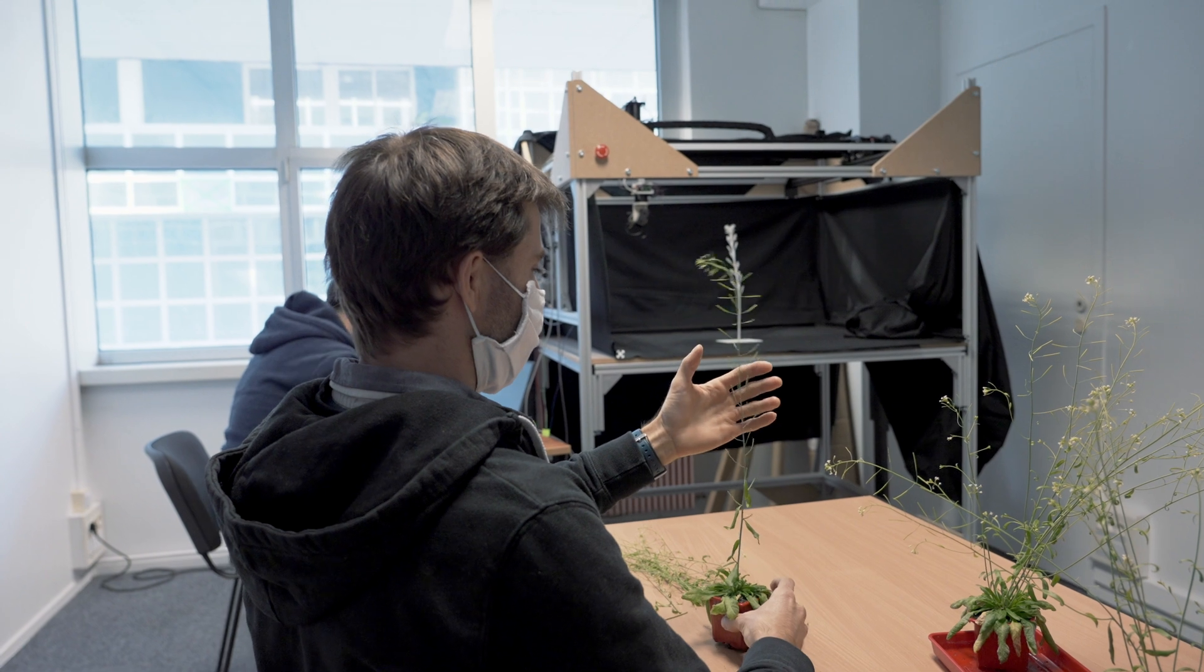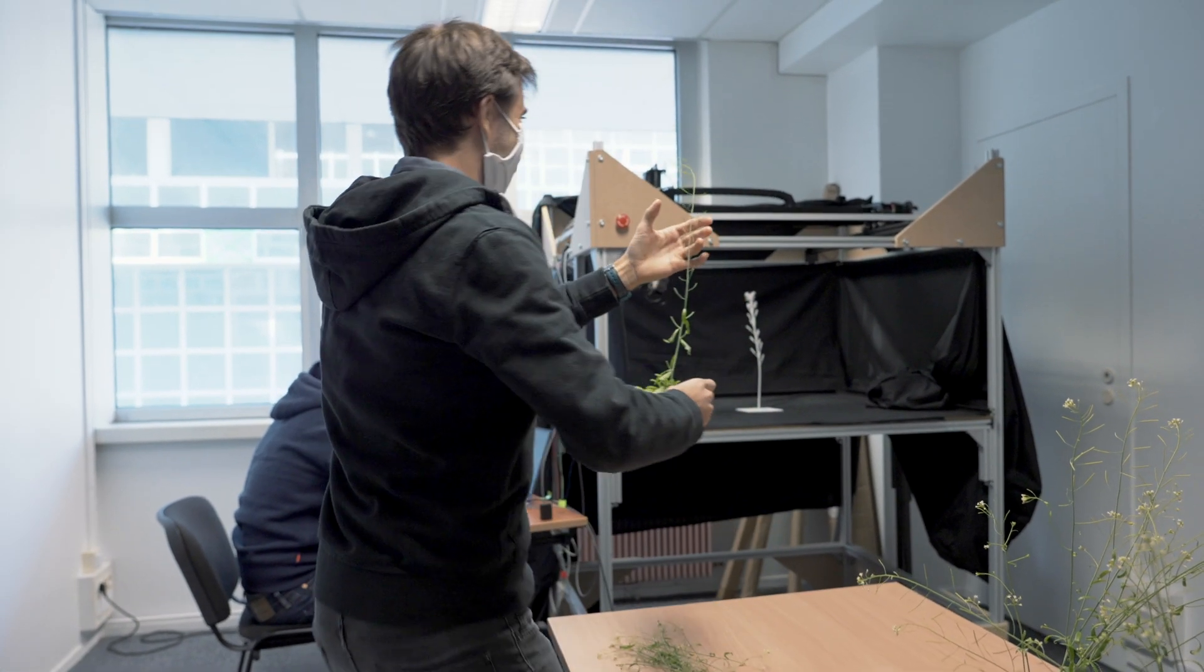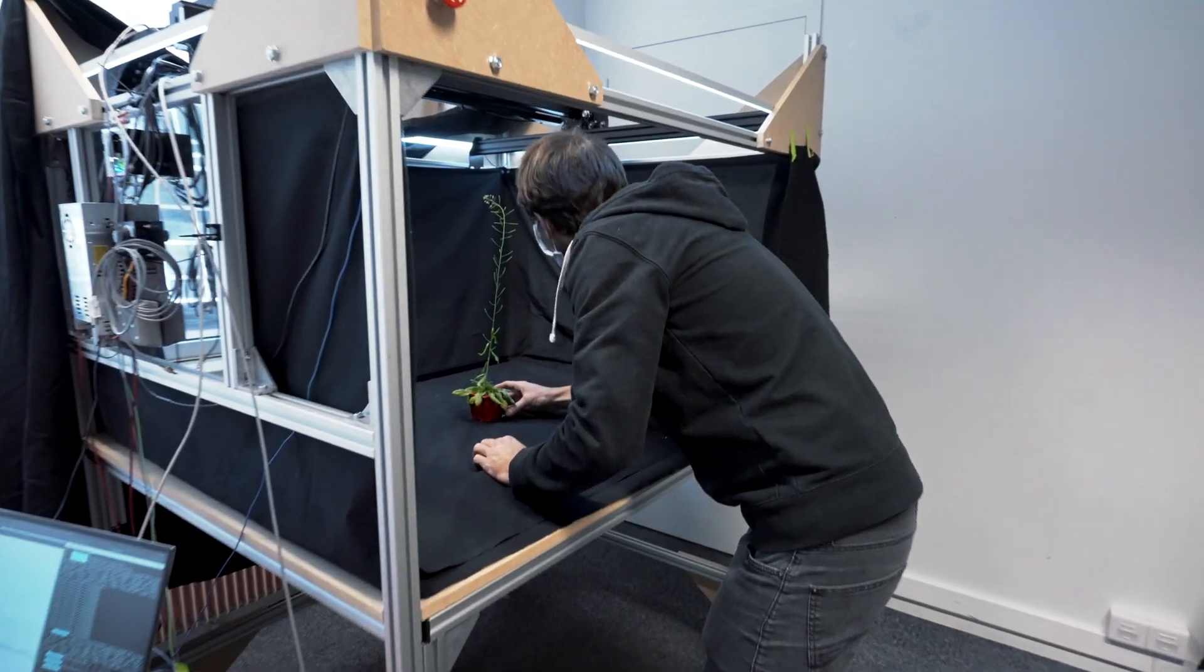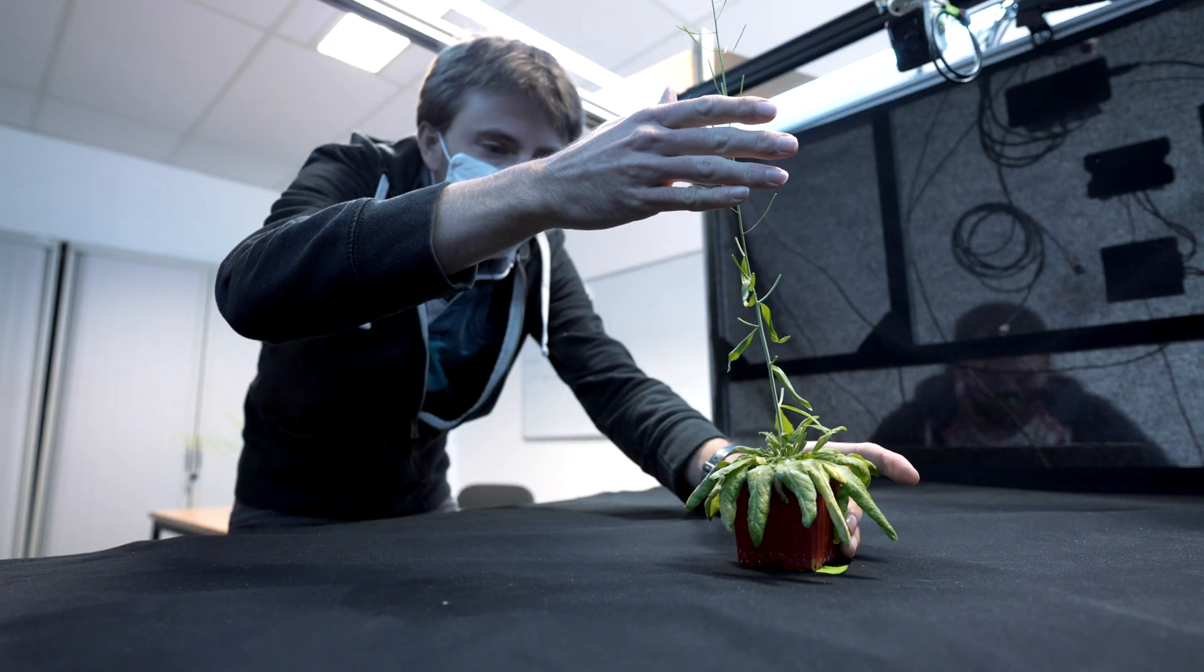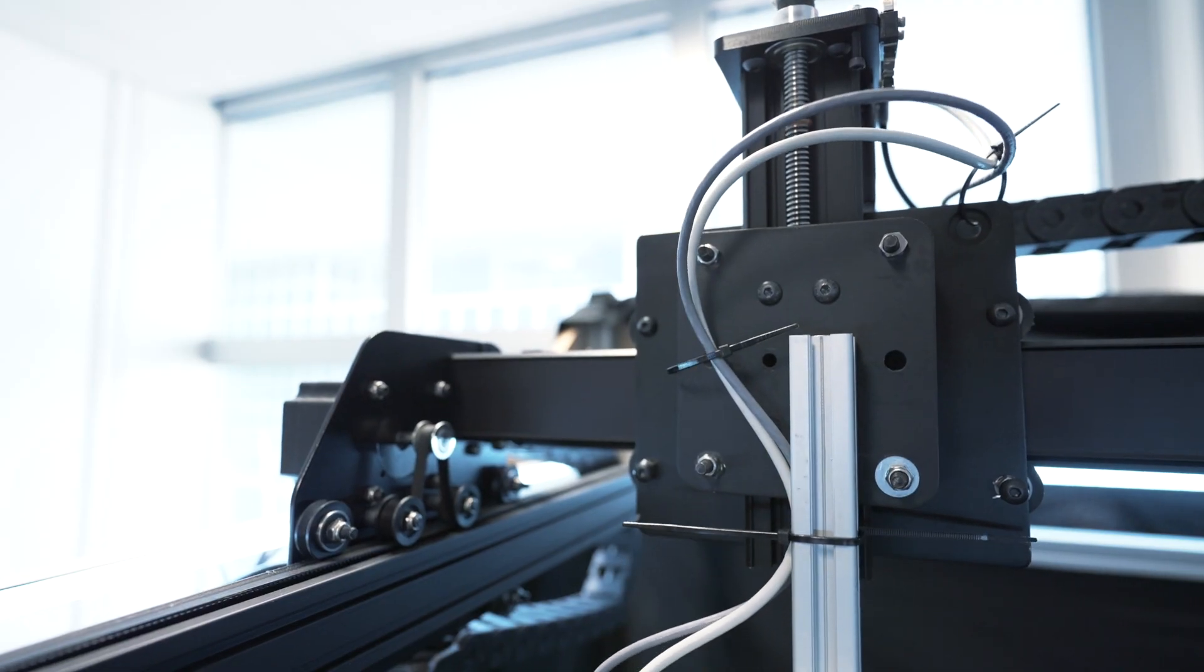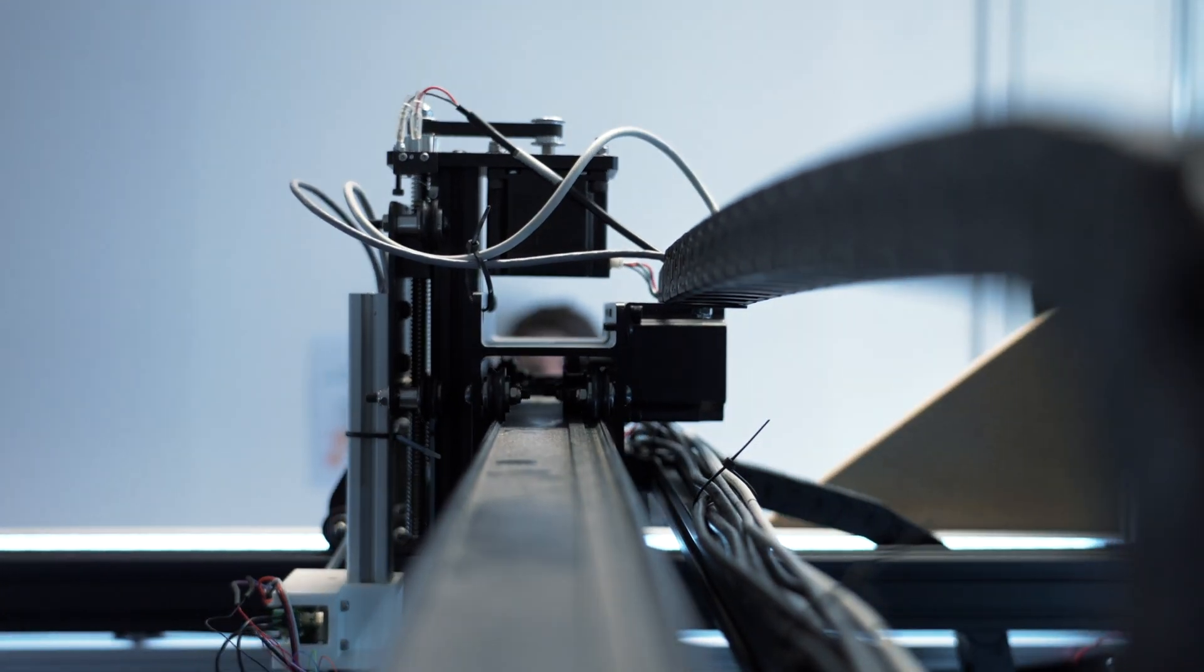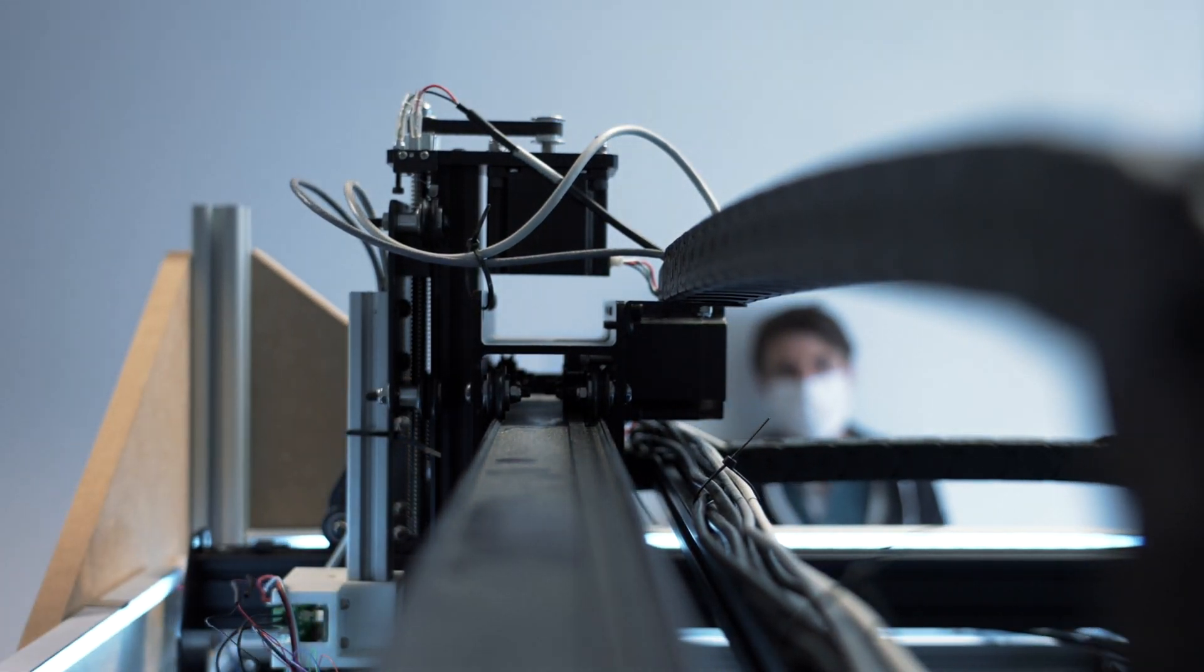The Romy Plant Scanner is a plant phenotyping robot that generates high quality and high precision image data. It allows us to analyse the shoot architecture of a medium-sized plant in indoor conditions in three dimensions.